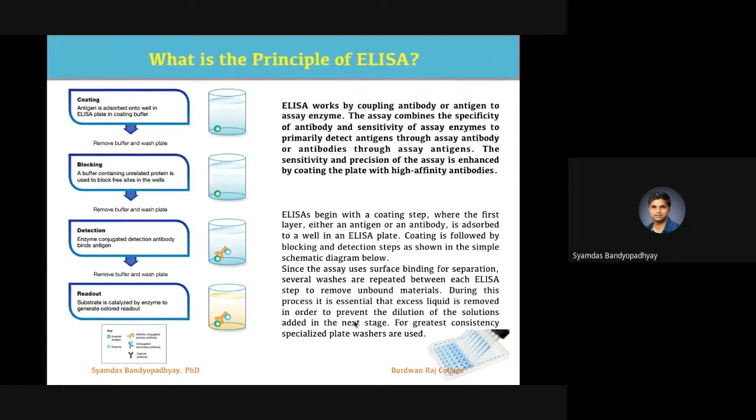Now, let's come to the principle of ELISA. First you have to understand it's a multi-step process like RIA. I can tell you in greater detail, because ELISA is a very common technique performed in immunological laboratories and various biotechnology laboratories. So what are the steps of ELISA? That will tell you about the principle of ELISA, right?